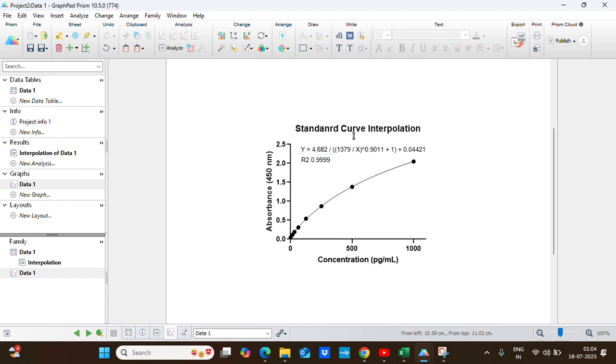So this is your standard curve. Now many things you can do in the formatting and presenting data with more statistical constants. I hope this video helps you. Thank you.